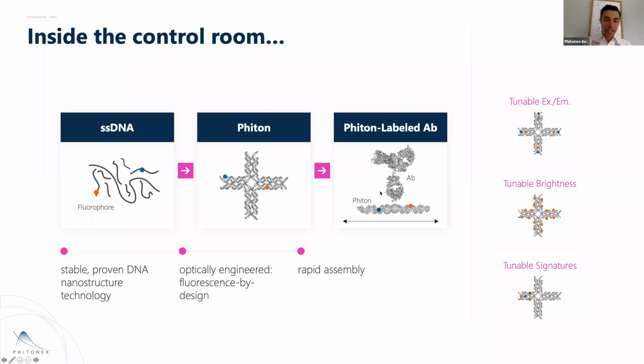But this also enables us the ability to think about, I've got 4 different independent arms of the structure. It also enables me to tune brightness, right? And we've also used these to develop spectral signatures, although that's just something where we just know that the field isn't ready for that yet. So anyway, that's my new element for Catherine for today.